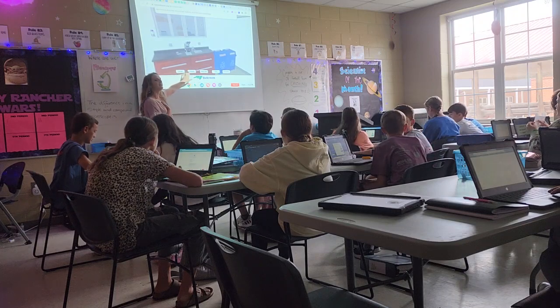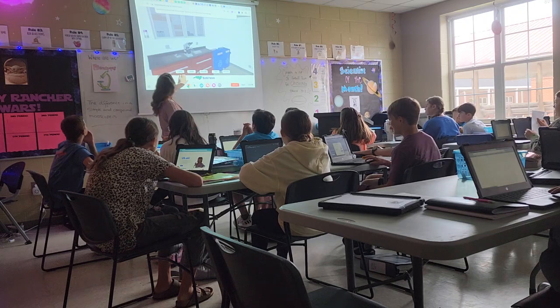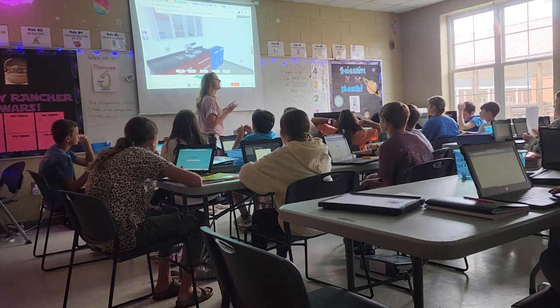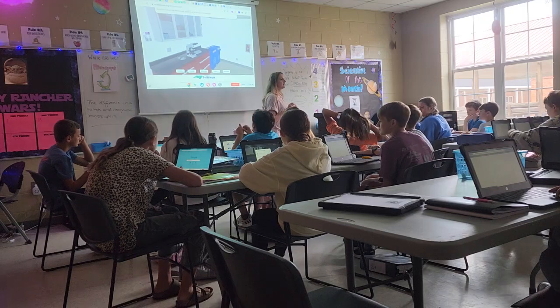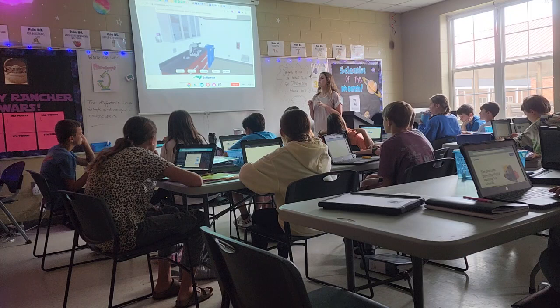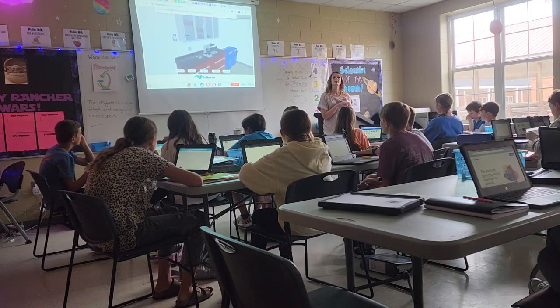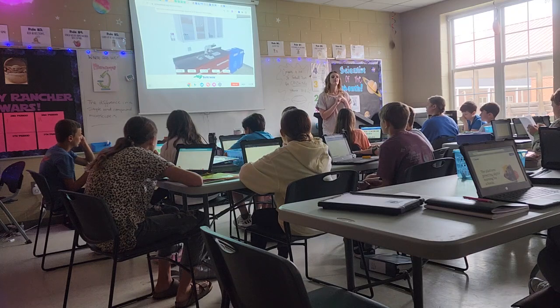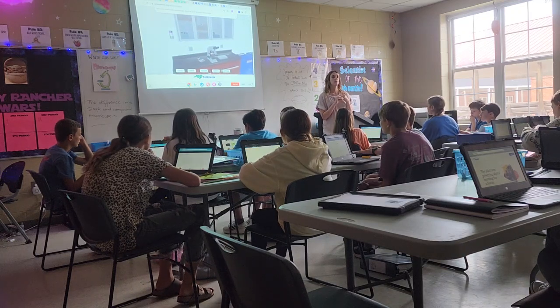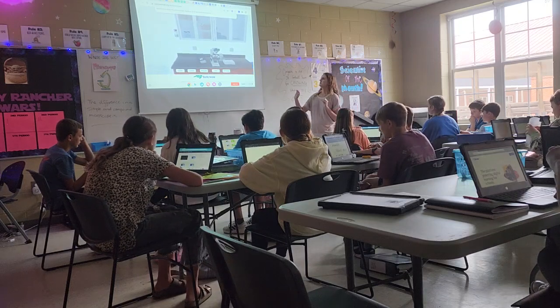It's going to take us to this. On our lab, we're going to do Guide, Learn, Explore, and Test. Now, this is not for a test grade. This exercise is to familiarize yourself with the proper procedures of a microscope, because tomorrow we're going to be looking at prepared slides. Friday, we're going to be looking at a live specimen of pond water to draw what we see. Today, we are learning the procedure.